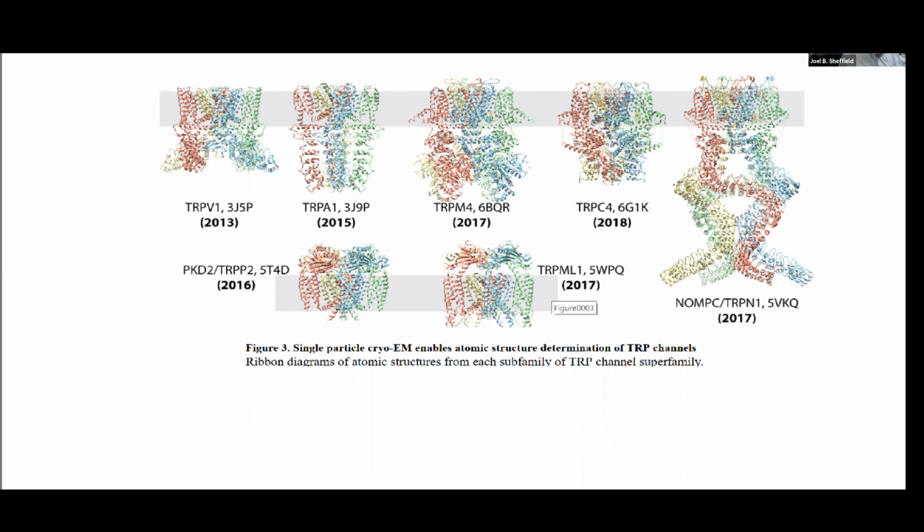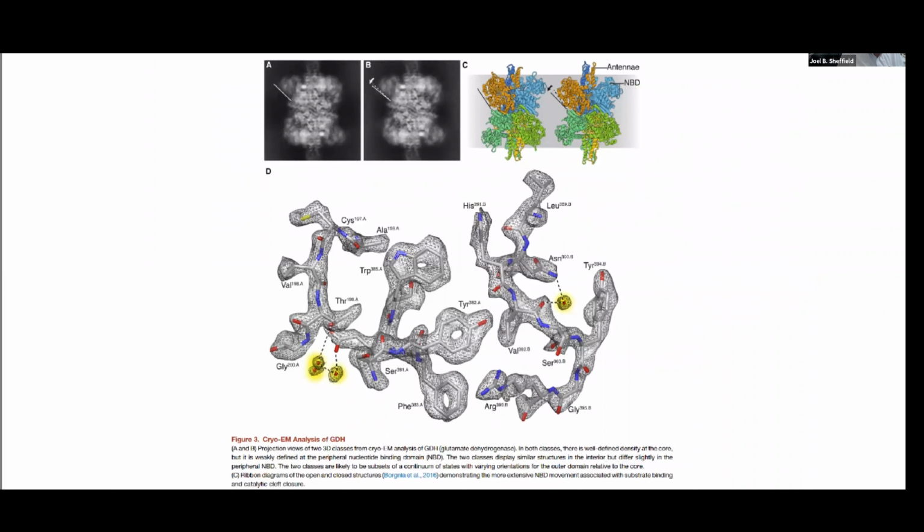They're really able to look at, see over here, some of the free loops within that amino acid chain. And here are the helices, very obvious. And these are coming not from theoretical considerations, not from the sorts of NMR calculations that you see in all of the standard molecular modeling. These are things that come out of electron microscope images with a remarkable amount of appropriate structure that comes from it. And let me give you two more examples.